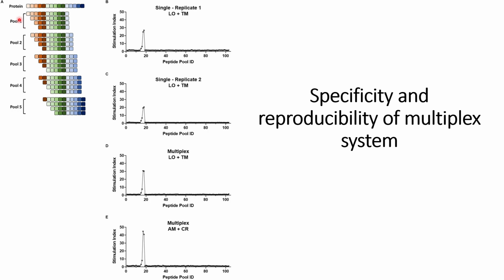So we can see that in pool 1, the peptide shown on the top row is the longest, and as we go to the different rows, we can see a decrease in the peptide length, but they end at the same position.